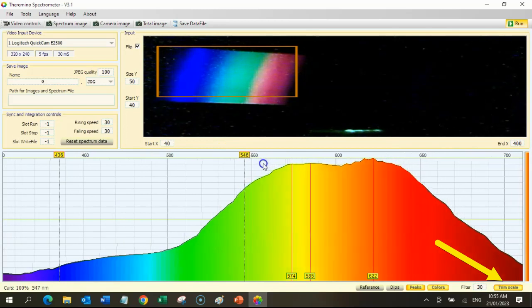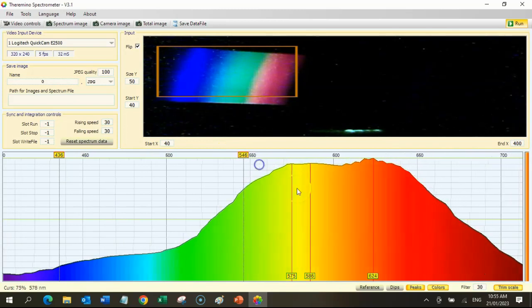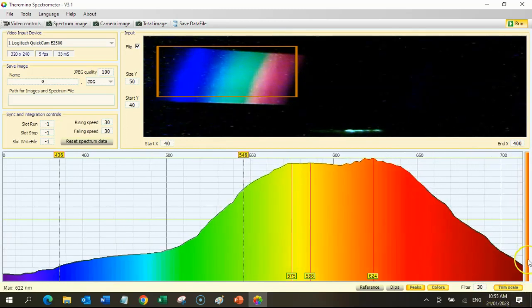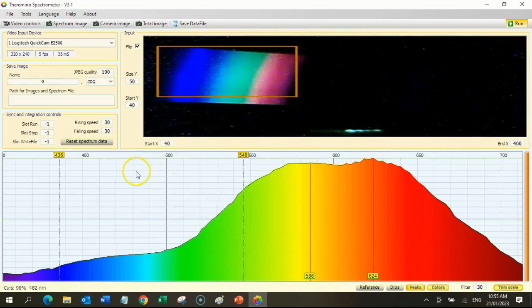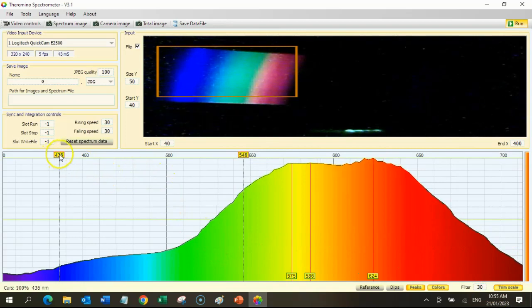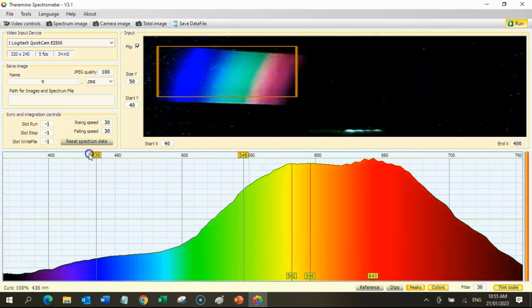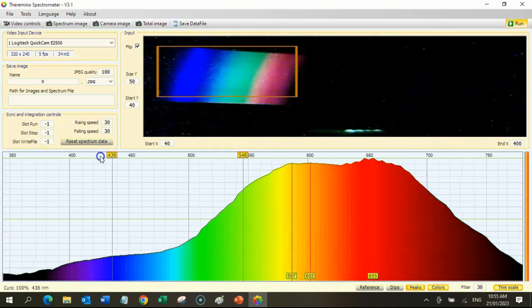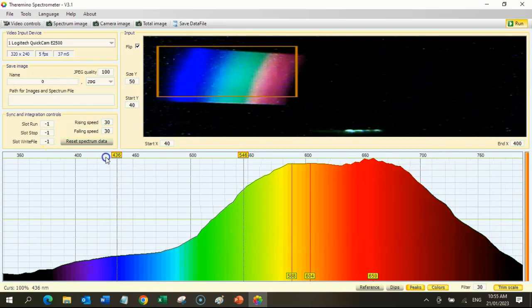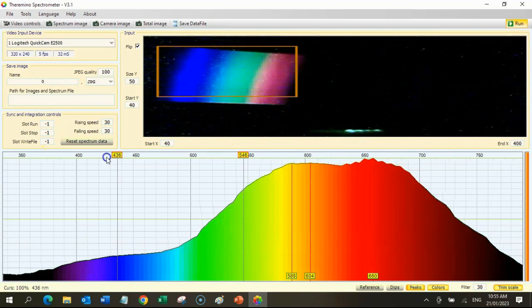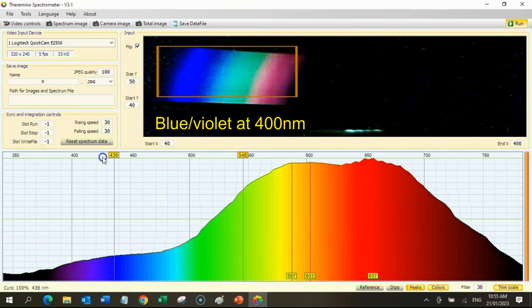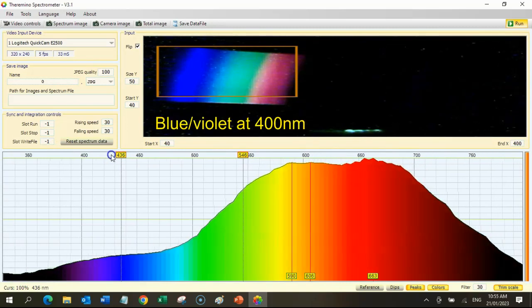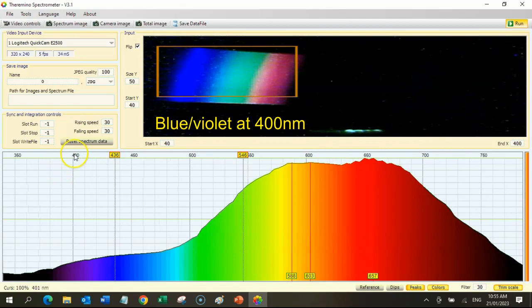Then adjust the two yellow markers so that the red on the top window lines up with the red on the lower screen, about 700 nanometers.